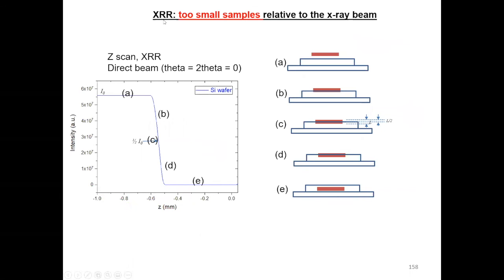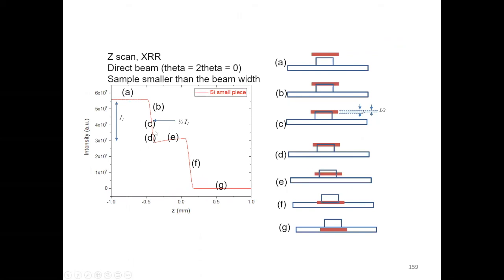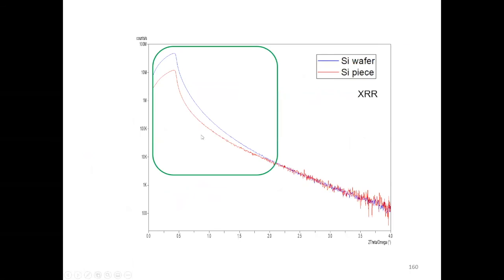So in summary, what do you take home from this? I think the main message is that when you start comparing what you got with what other people got, or someone brings you data, ask questions. What were the exact measurement conditions that were used? Number two, when you do a measurement, choose your measurement conditions.